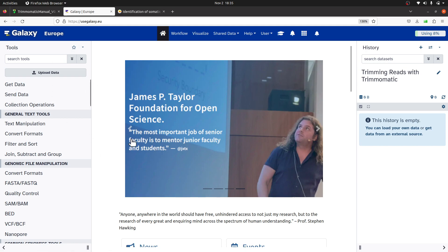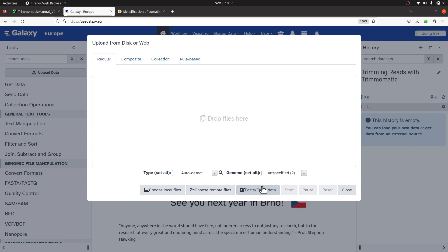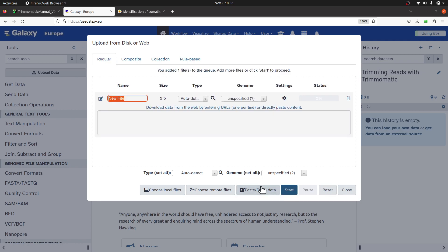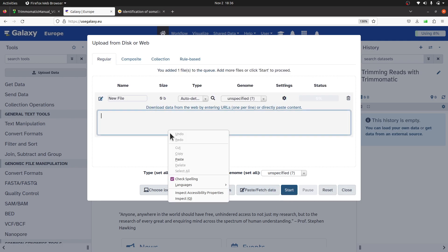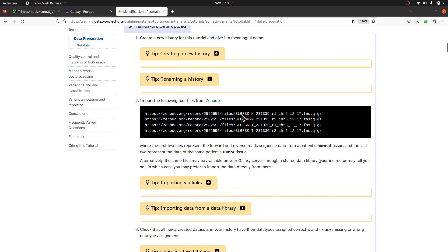Now I'm going to upload my data. I'll click 'Upload Data' and then go to 'Paste/Fetch Data', because we are importing from the internet — these files are not on our local system. I'll paste the file URLs here.